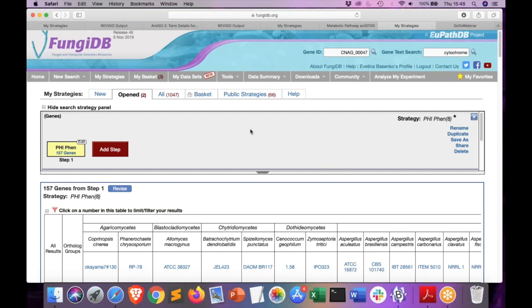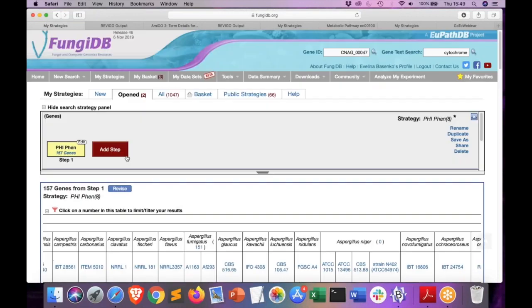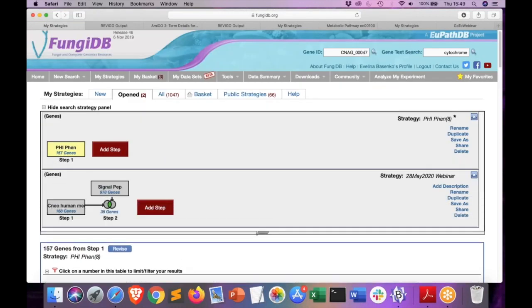Great, thanks. So another question which we answered, but I thought it would be good to bring up, and I can go ahead and answer it since I replied to it in the questions. The question was, what about hypothetical genes? How do they relate to GO terms? That's a really good question, because often in genomes you have hundreds of genes that are annotated as hypothetical, so they don't have a product description. So how can you use these in GO enrichment? The answer really depends.